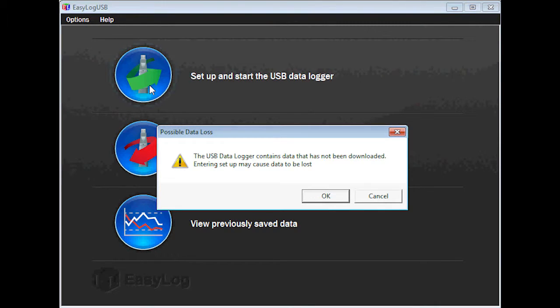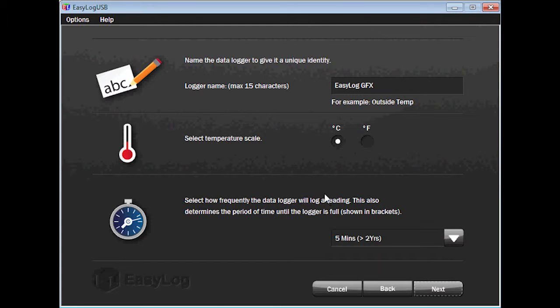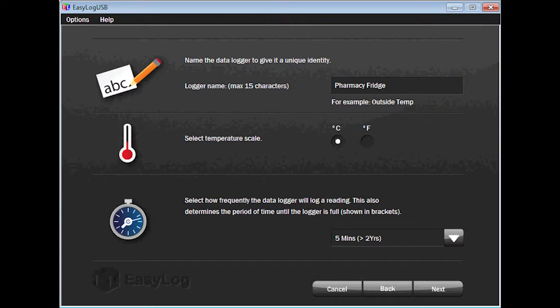If a window appears alerting you that the logger contains data that has not been downloaded, go ahead and press OK. By default, the name of the device is Easy Log GFX. You can change the name of the device to anything you like using 15 characters or less. I'll name my device Pharmacy Fridge.